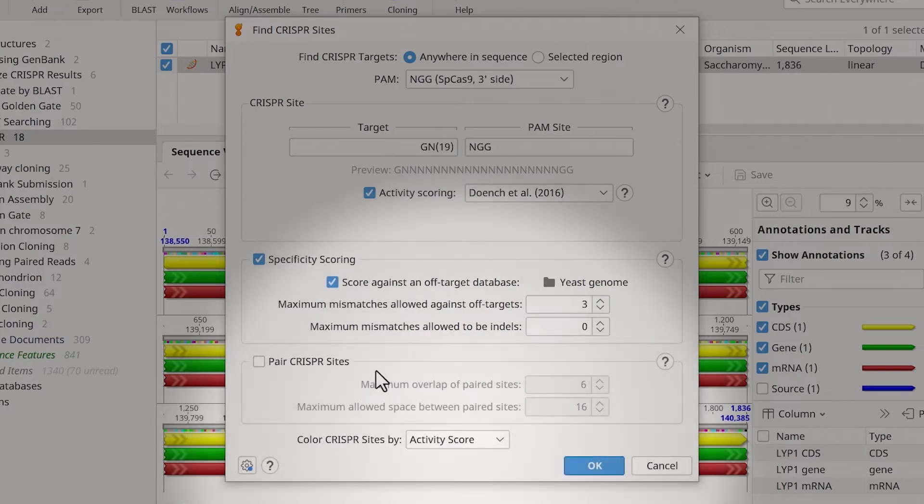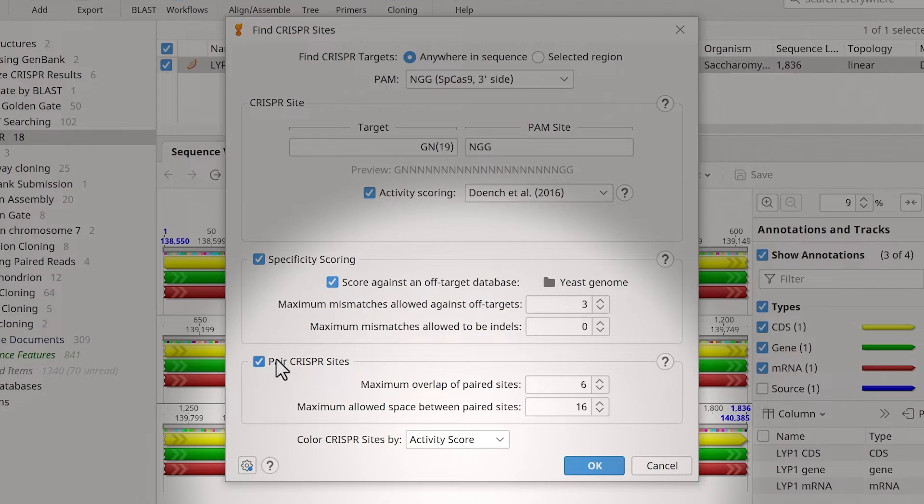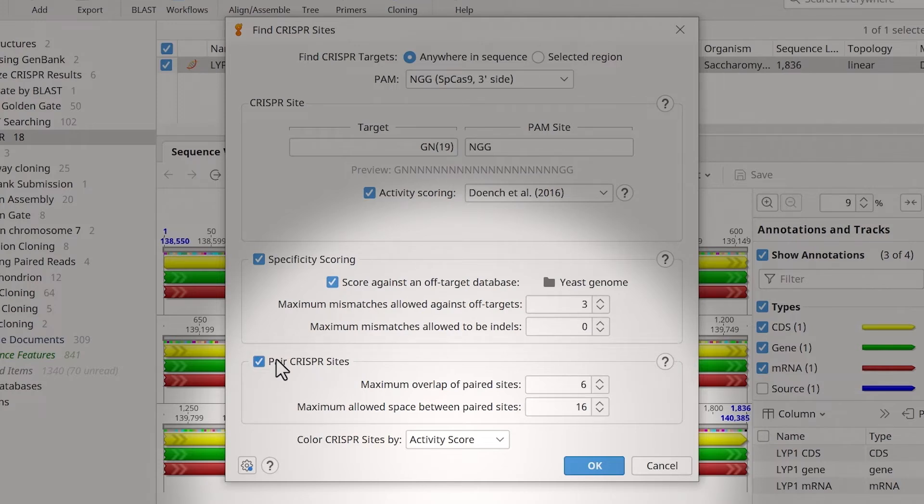Next, ensure you tick the box next to Pair CRISPR sites. It's possible to adjust the maximum allowable overlap of the sites returned and the maximum space allowed between the paired sites. These values are measured from the 5-PAM distal end of the CRISPR sites.